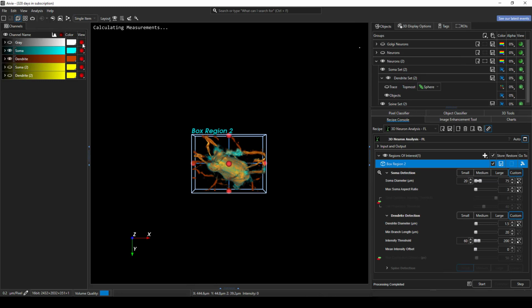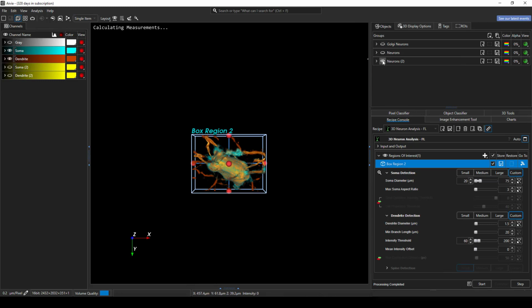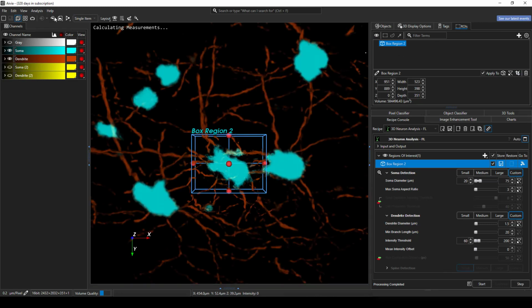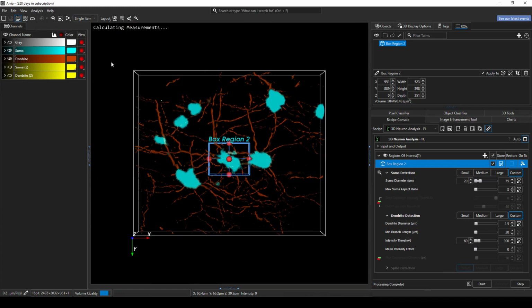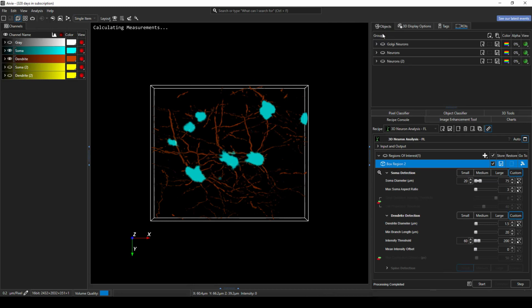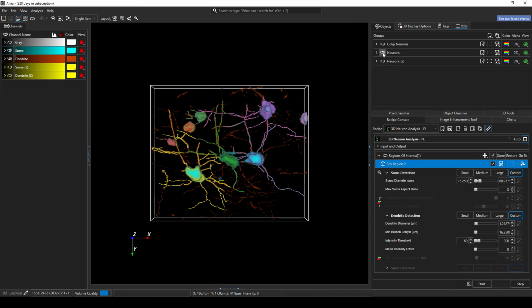thing of providing you with previous results that I've done, and this time for the full image. Let's remove this clipping here. Zoom out a little bit so that you see it a little bit better. And then finally, let's turn on those results that I have already done. This looks pretty good. And we can see that there are multiple somas with dendrites connected here.